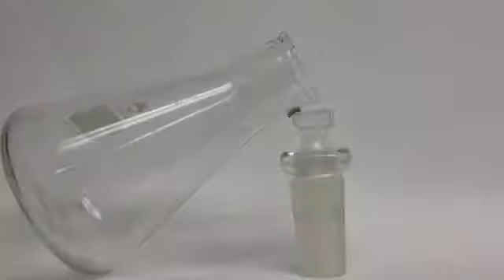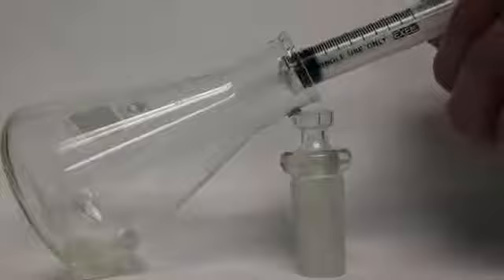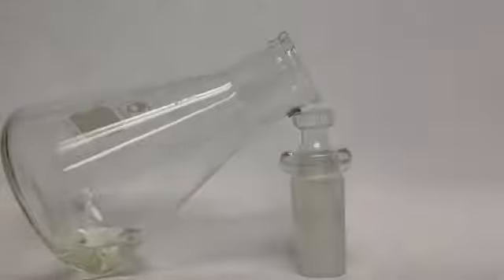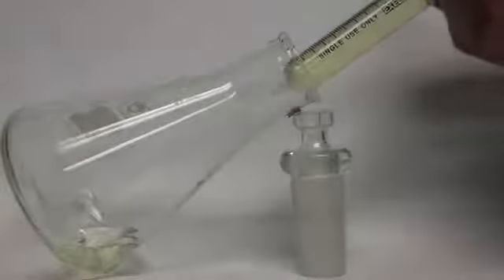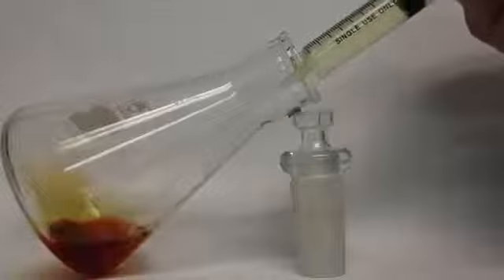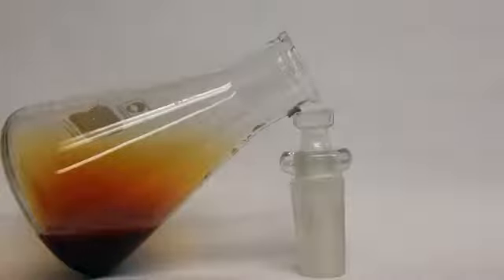Next is a reproduction of an incident wherein bleach is inadvertently added to a container of HB2. Pure HB2 goes in the flask first. Now for the bleach. The red coloration of elemental bromine should give the operator making the error a visual indication that something is wrong and to stop the addition of the bleach. Note, the dense bromine fumes never leave the container.